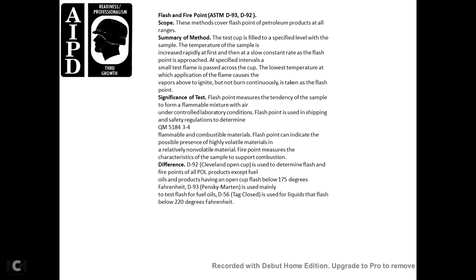The flame is passed across the cup. The lowest temperature at which application of the test flame causes the vapors above the sample to ignite, though not to burn continuously, is taken as the flash point. Significance: flash point measures the tendency of the sample to form a flammable mixture with air under controlled laboratory conditions. Flash point is used in shipping and safety regulations to define flammable and combustible materials.